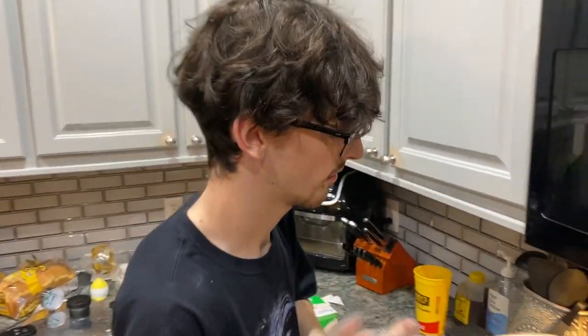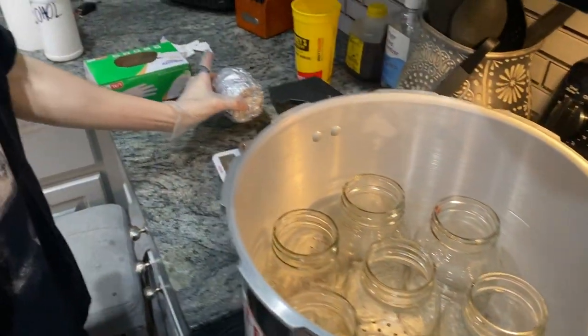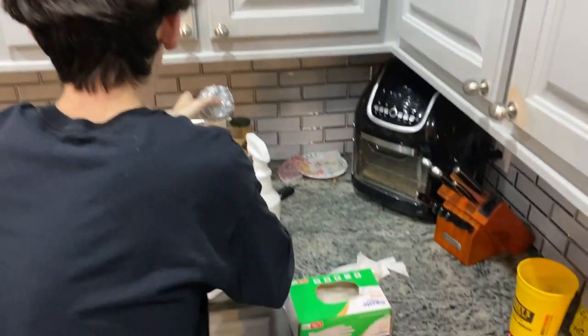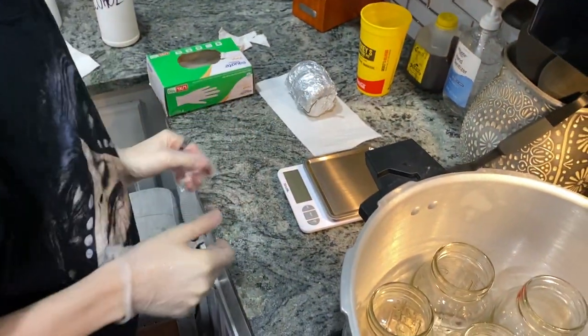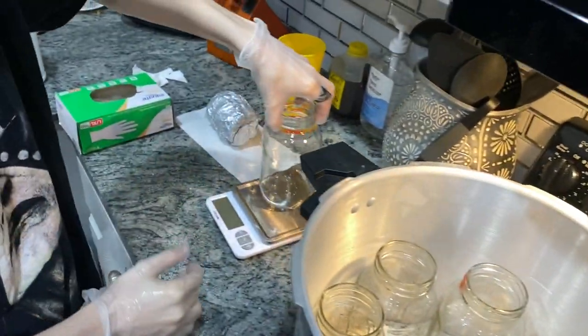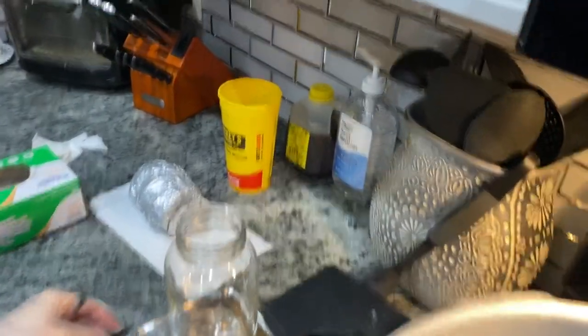The modified lids greatly reduce the risk of contamination. Next, we're going to begin making the media that we'll spawn our live culture in. This media basically just needs a specific ratio of complex natural sugars and water — specifically 24 grams of honey and 600 milliliters of water per jar.